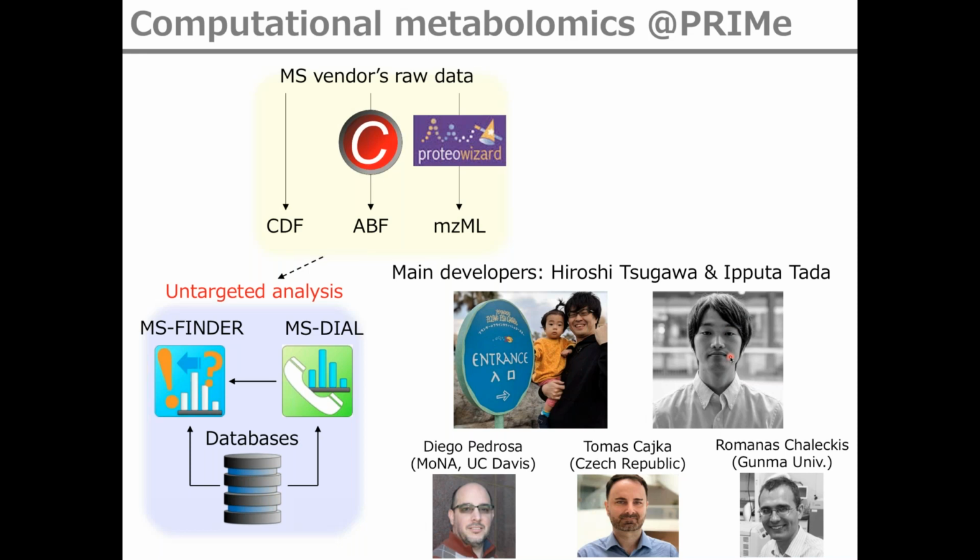He is also developing many useful graphical user interfaces for GC-MS and conventional LC-MS projects. And Diego Pedrosa created the function to link MS-DIAL with MassBank of North America.